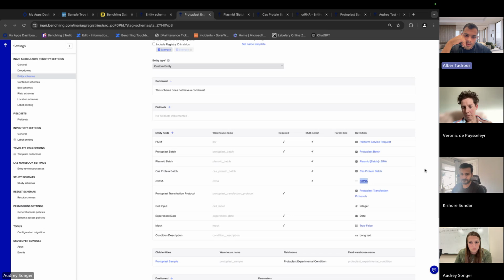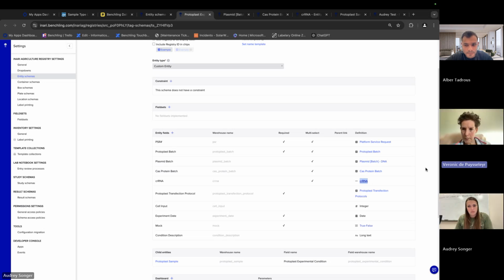Okay. Okay. Yeah. You will see that, yes, that's relevant information. If possible, we don't have it as a metadata field, but if you would be able to code that, so write a little bit of logic, so that's the protoplast transfection method. It's hybrid, plasmid, or RNP. Okay.